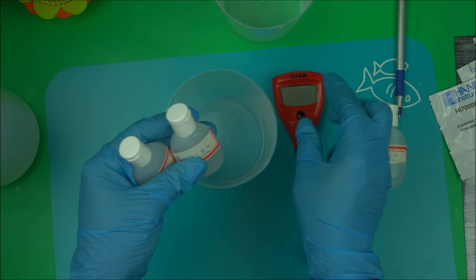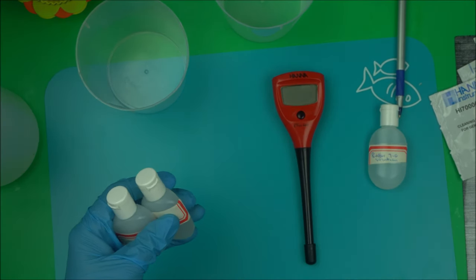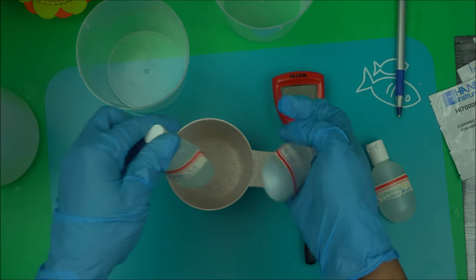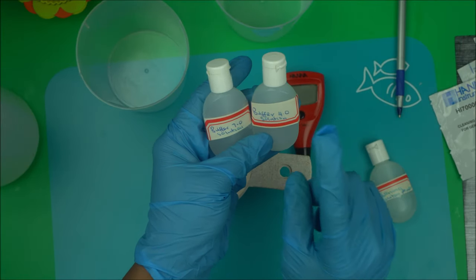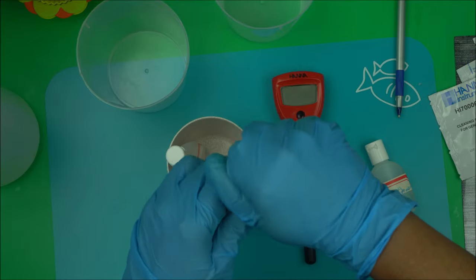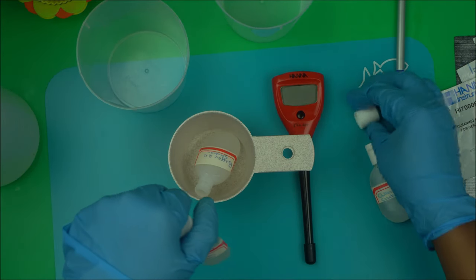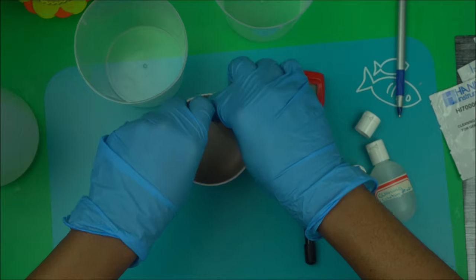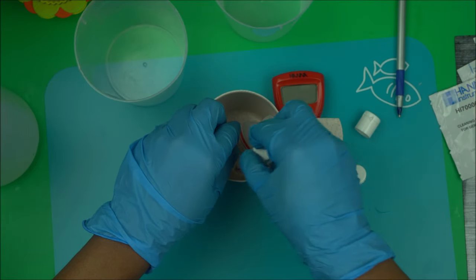Now let me show you how I calibrate mine. You need the two buffer solutions. I have containers I bought from the store — I pour my buffer solution in them, the 4.0 and the 7.0, so they're ready to go anytime I want to calibrate. Be careful with them because buffer solution is a bit expensive.